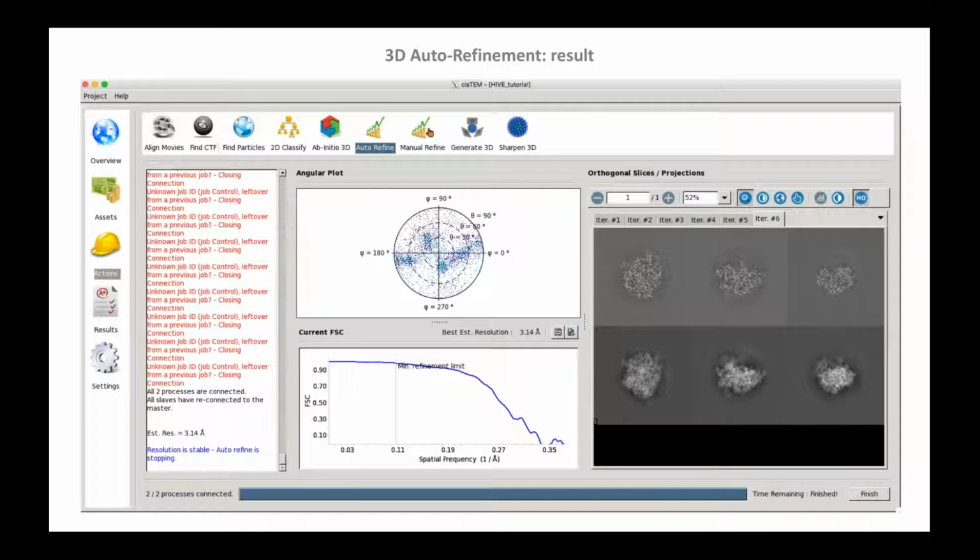One of the slides I talked about the projection, and the projection can correspond to differences in orientation or different structural states, and you don't know. You may not notice.